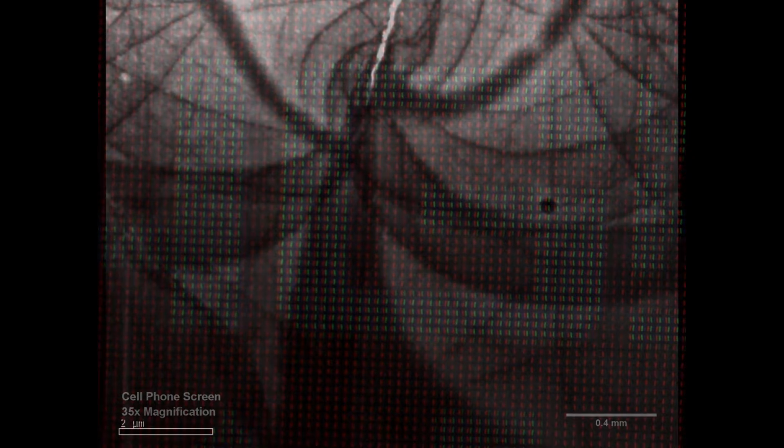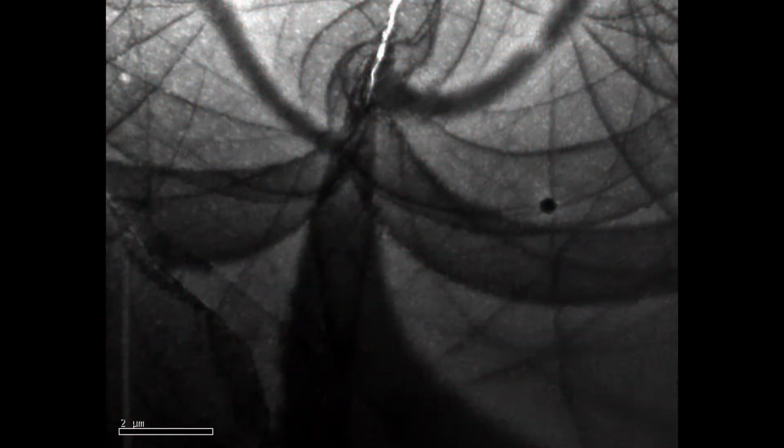Each student got assigned 1 hour per week as their microscope time to spend alone at the microscope, finishing assignments, or sometimes just refreshing what they know. And the pictures seen throughout this video have been what I consider my most aesthetically pleasing microscope pictures, or micrographs, that I took in Delta's program. You'll notice that they're all in black and white. That's because these instruments detect electrons. They choose what grayscale value based on how many electrons hit the detector at that spot.